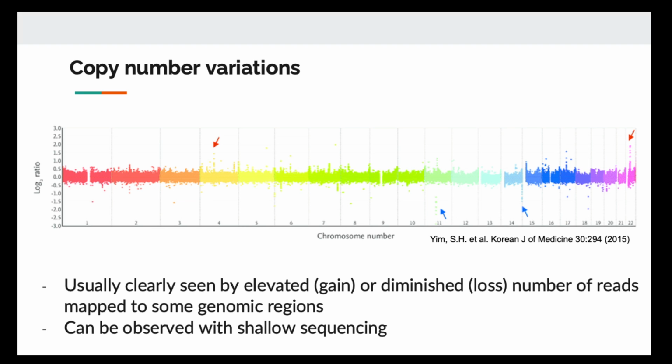For copy number variation, I mentioned that if you want to identify copy number variation for a gene, which is a small segment of the genome, that's difficult. But if you are studying cancer or maybe some plants or animals that have variation in their copy number of the chromosome, like a large scale copy number variation, like extra copies of an entire chromosome or half of the chromosomes, then even with short reads, you're going to be able to detect it, because you will see many more reads coming from a continuous region on the genome.